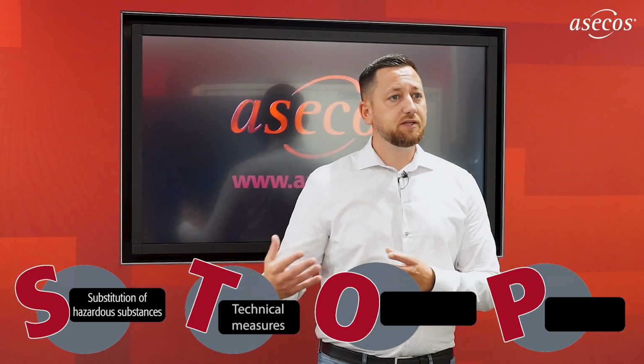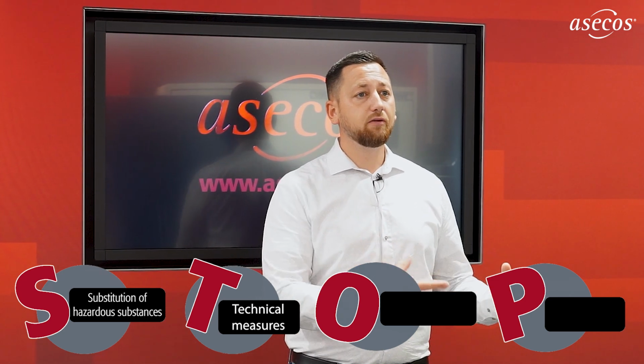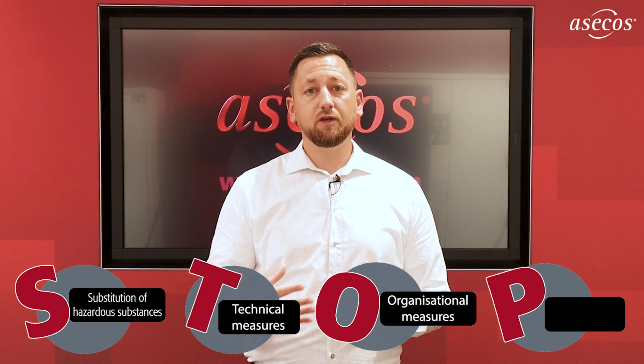S stands for substitution. In other words, can hazardous substances be dispensed with or replaced with less hazardous substances during the activity? T stands for technical protective measures. What technical measures can be taken to ensure protection for people and the environment? O refers to the organizational protective measures. For example, can work processes be optimized to increase protection?